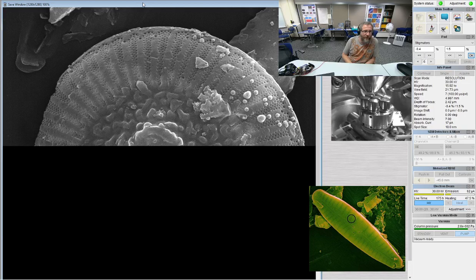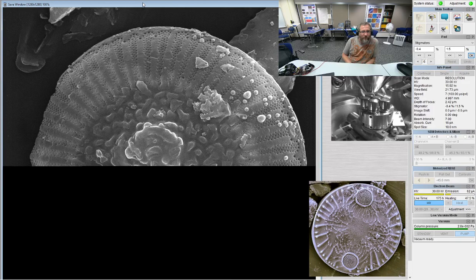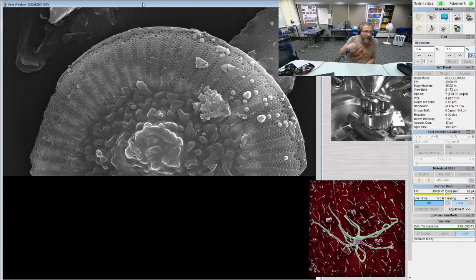This one has some weird looking spines. They're really just nubs, aren't they? Yeah. Funny little. And this one is really colliculate, like the middle part. It's very colliculate looking.